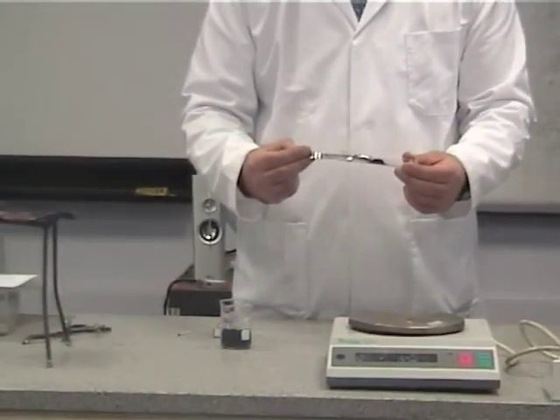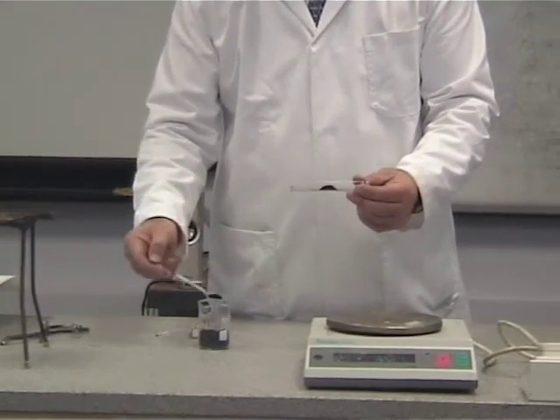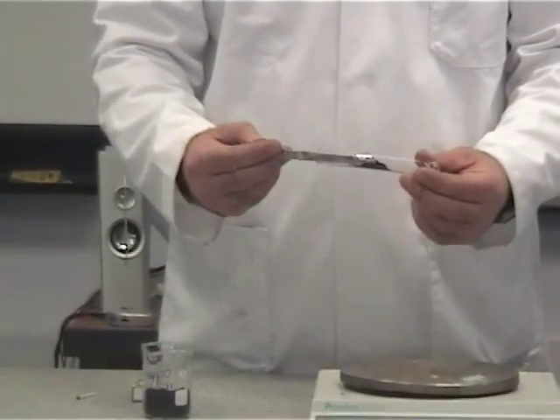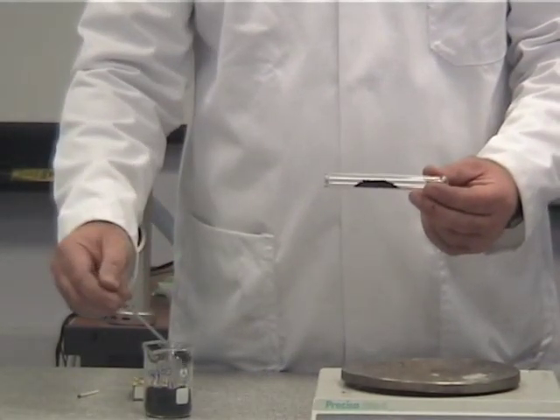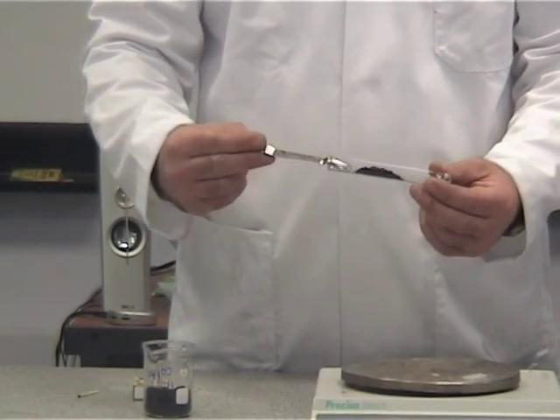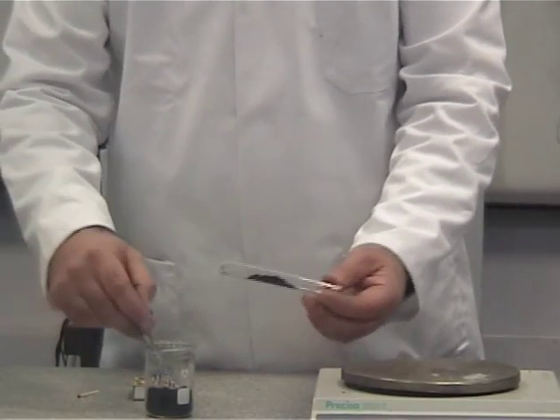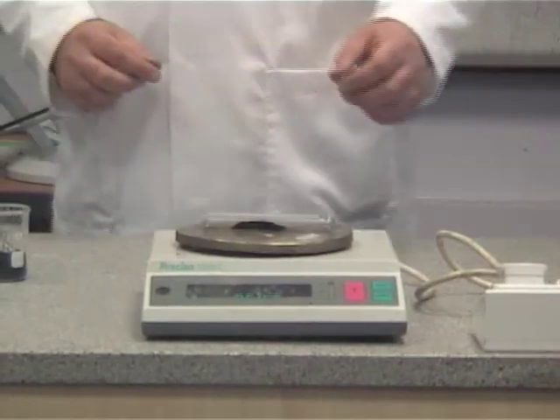And try to get the copper oxide into the centre of the tube again as best you can. Then when you're quite happy, you can reweigh it and record the results appropriately in your results table.